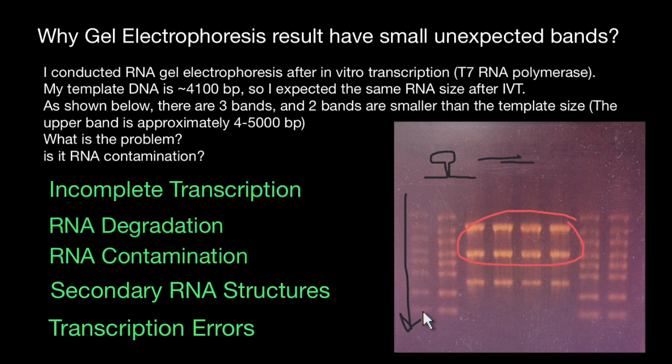Additional advice: denature the RNA samples by heating them at 65–70°C for 5 minutes, then immediately place them on ice before loading onto the gel. You can also consider verifying the size of RNA fragments using alternative methods such as qPCR or sequencing to confirm the presence of smaller bands. Make sure to rule out ribosomal RNA bands from your template preparation.